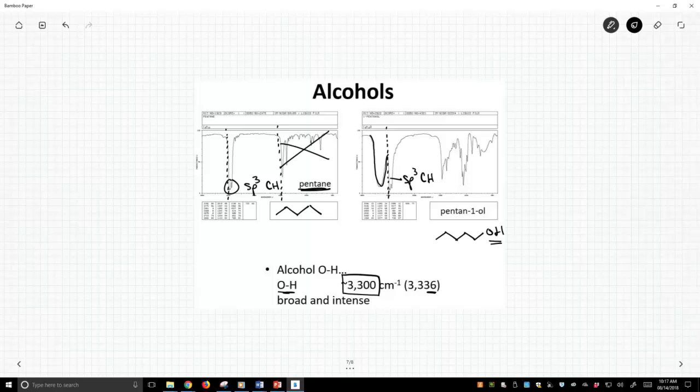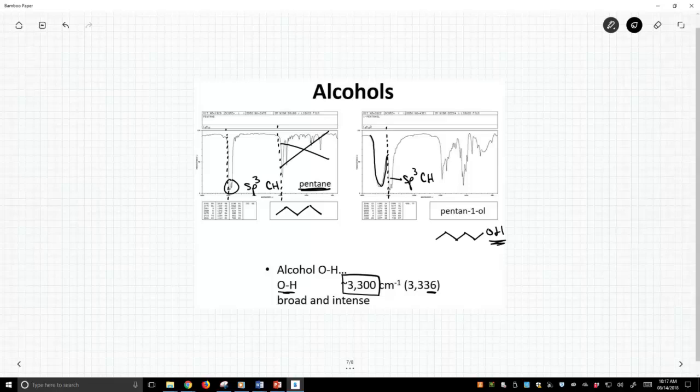These tend to be broad, meaning they're wide peaks. That gets into the fact that this OH group is undergoing hydrogen bonding interactions, which are variable within the sample. As it's variable, the peak gets fatter and wider.